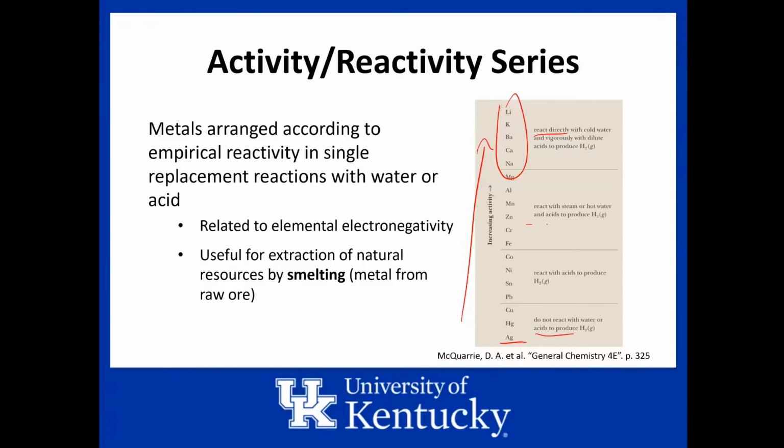If you move on down just a little bit, you have to actually put a little bit of energy into these. So they're not as reactive, but you can make them react pretty well if you just add a little hot water. And then if you add acid to the weaker ones, that will react, of course, very well.